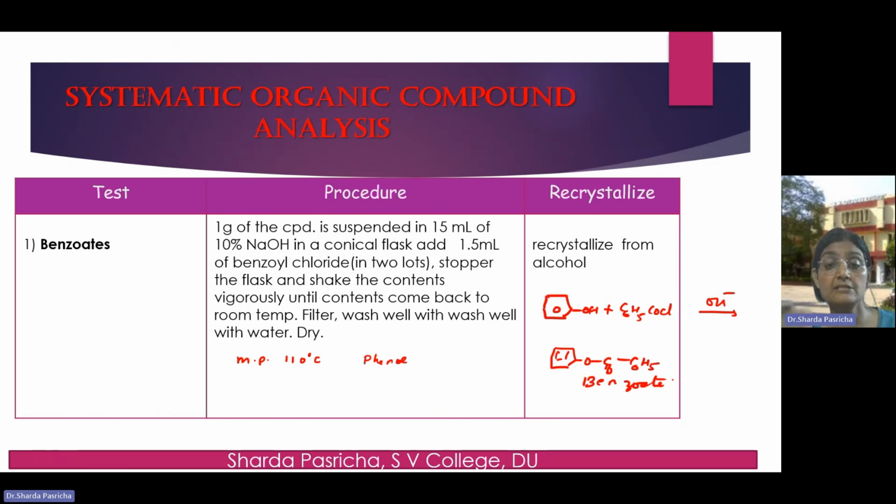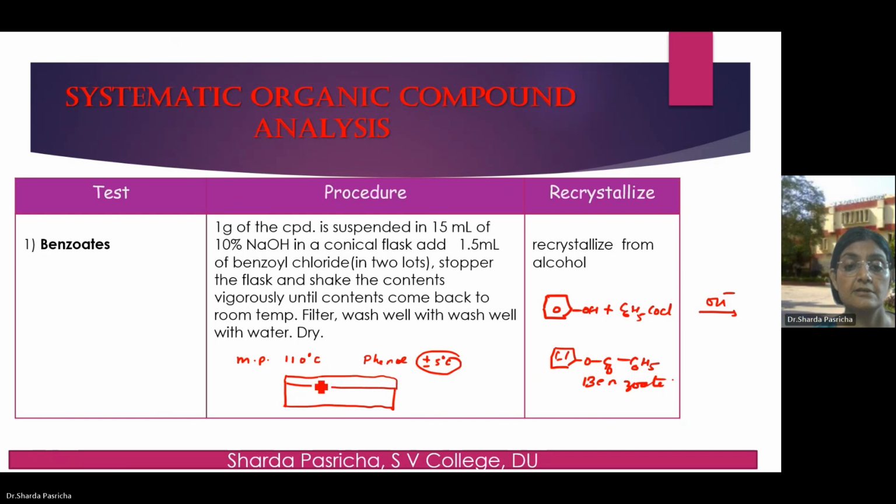At the end, there is a list of compounds categorized on the basis of functional group. So go to phenols, look at solids, and identify compounds which are coming within a plus or minus 5-degree range. So you will make a table, a list of probable compounds like this. Okay, this is the serial number.